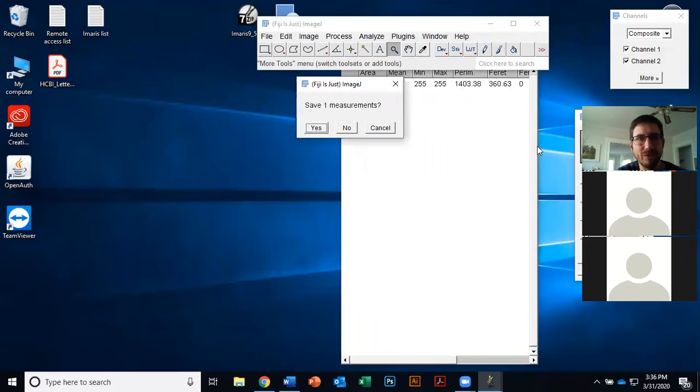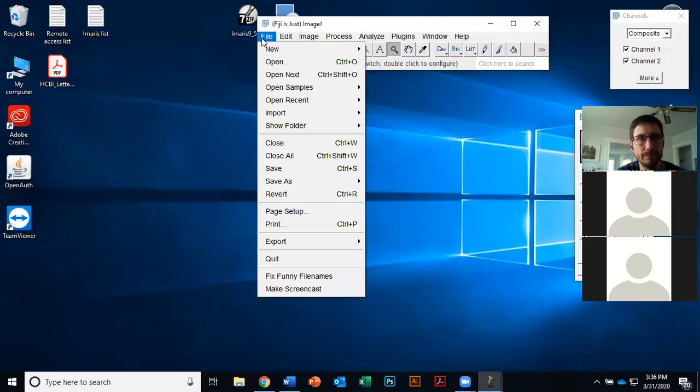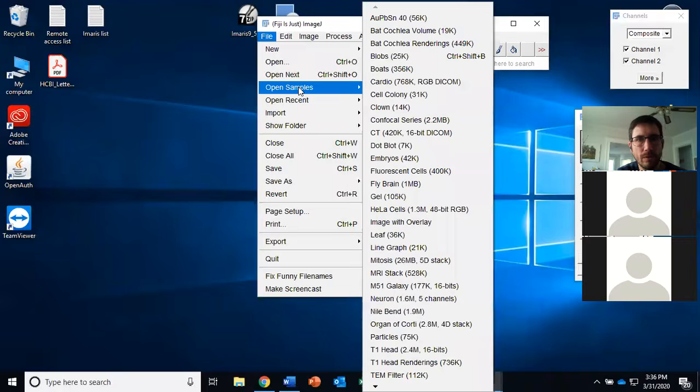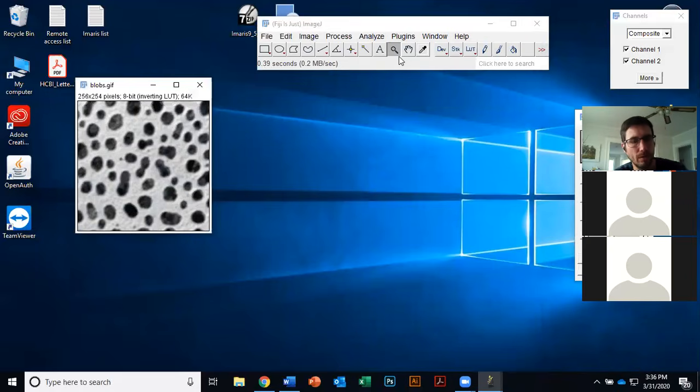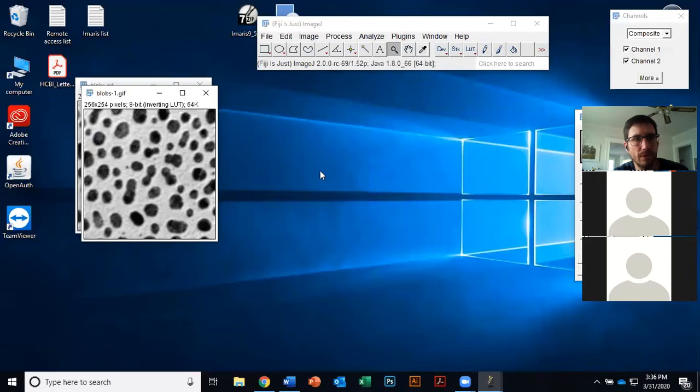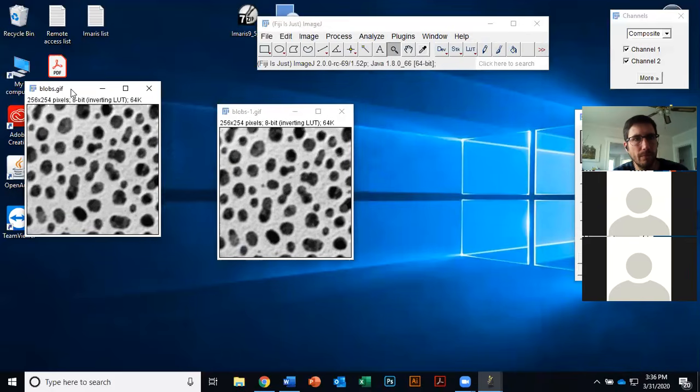Cool. So I had to invert that. Let's go back. I'm just going to duplicate this time so I don't have to go back all the way next time.